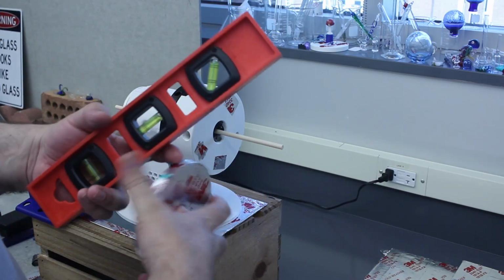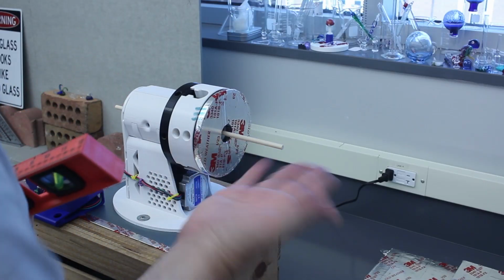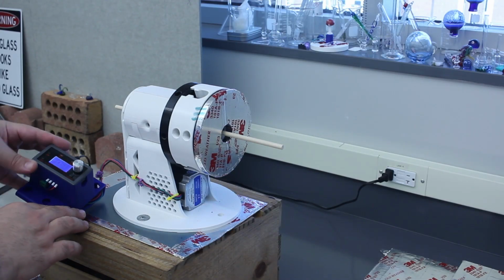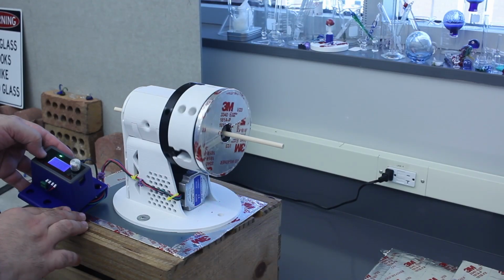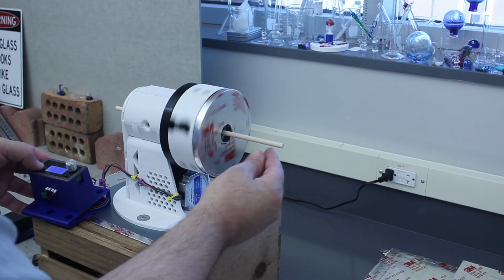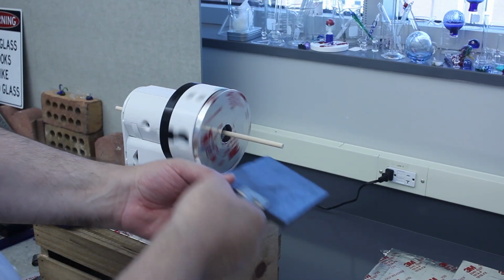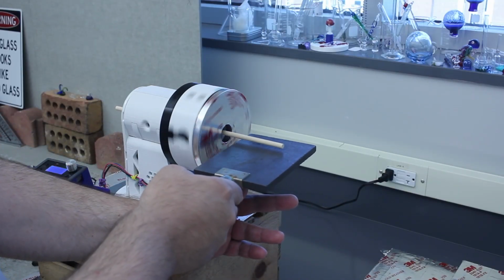You can put the blast shield, you can put the heat shield on just for good measure. So to operate the lathe, we've got our controller. So I push it this way, push it that way, right? And I can go ahead and center it. Kind of got it right there. One way to center it is to have a piece of graphite, like this graphite pad, and then bring it up and then go from there.